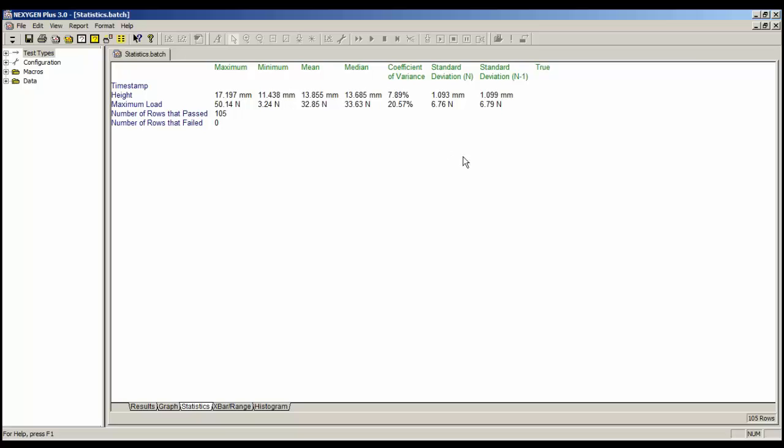For information, standard deviation n uses the same formula as Excel STDEV.P, and the standard deviation n-1 has the same formula as Excel STDEV.A.